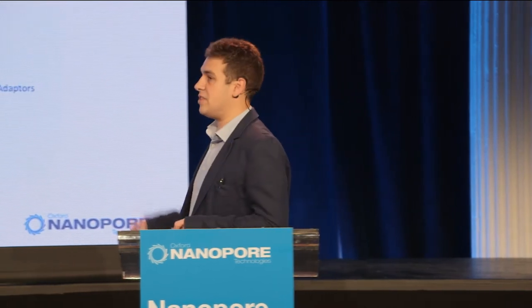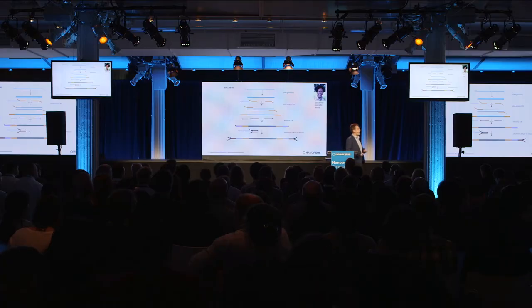And you can apply this to a specific assay. So in this case, we've taken the existing Zika multiplex scheme, but we've modified it to put tails onto the PCR primers so that we can then have the barcodes added to them, and then the rapid 1D adapters click on.